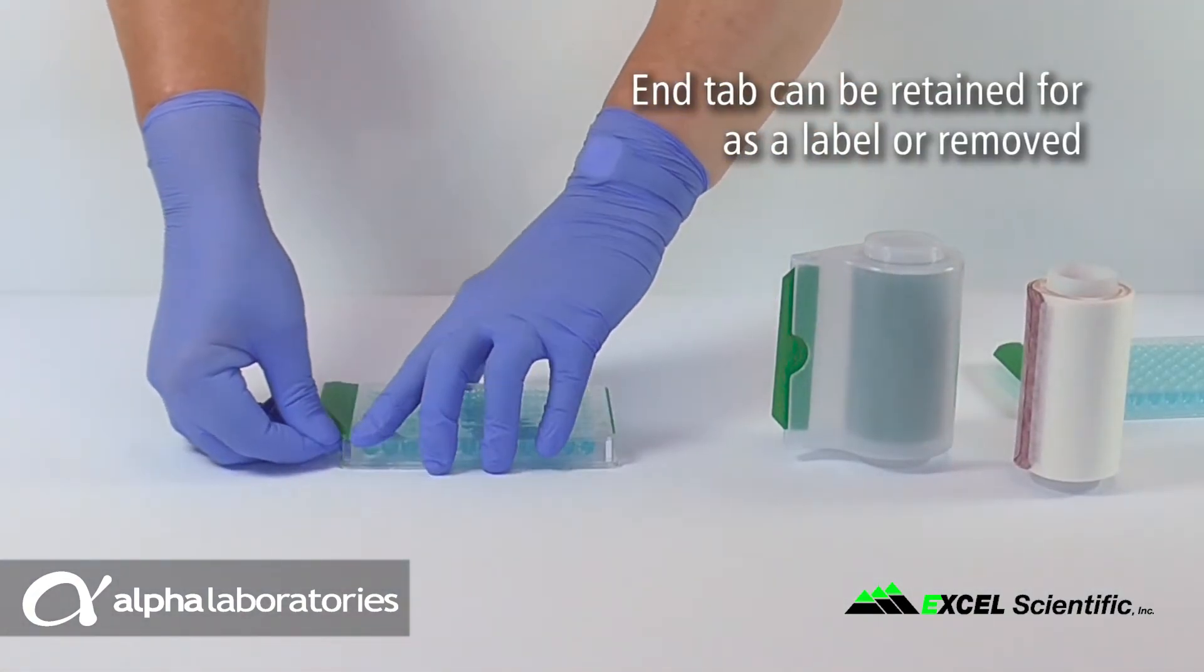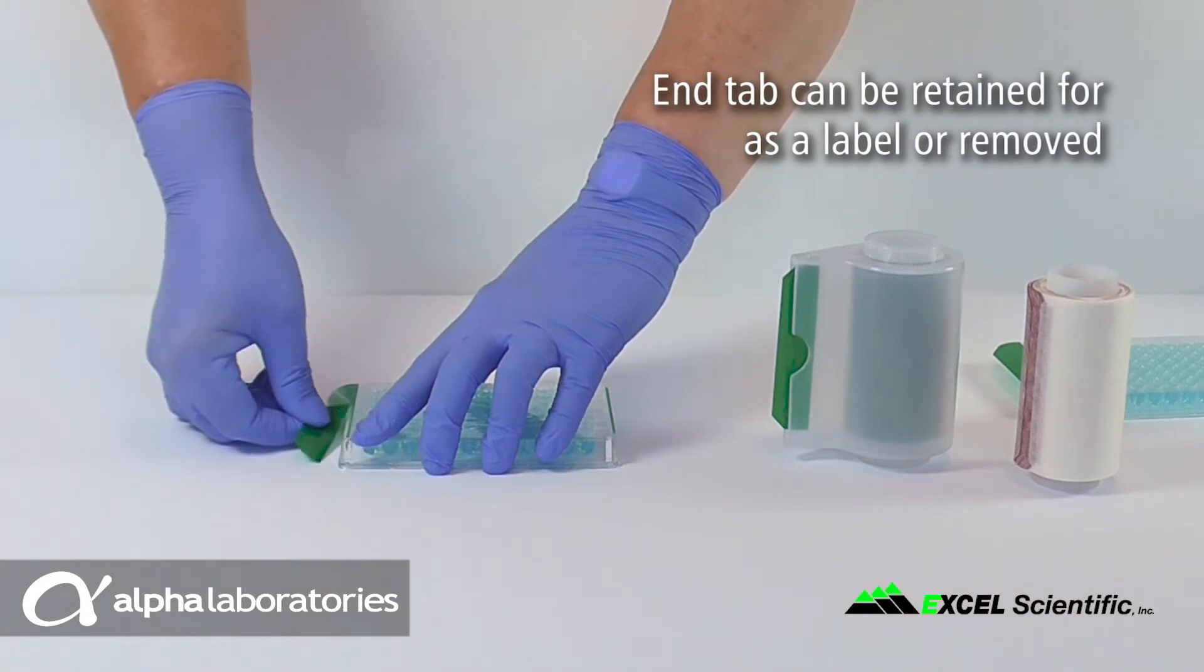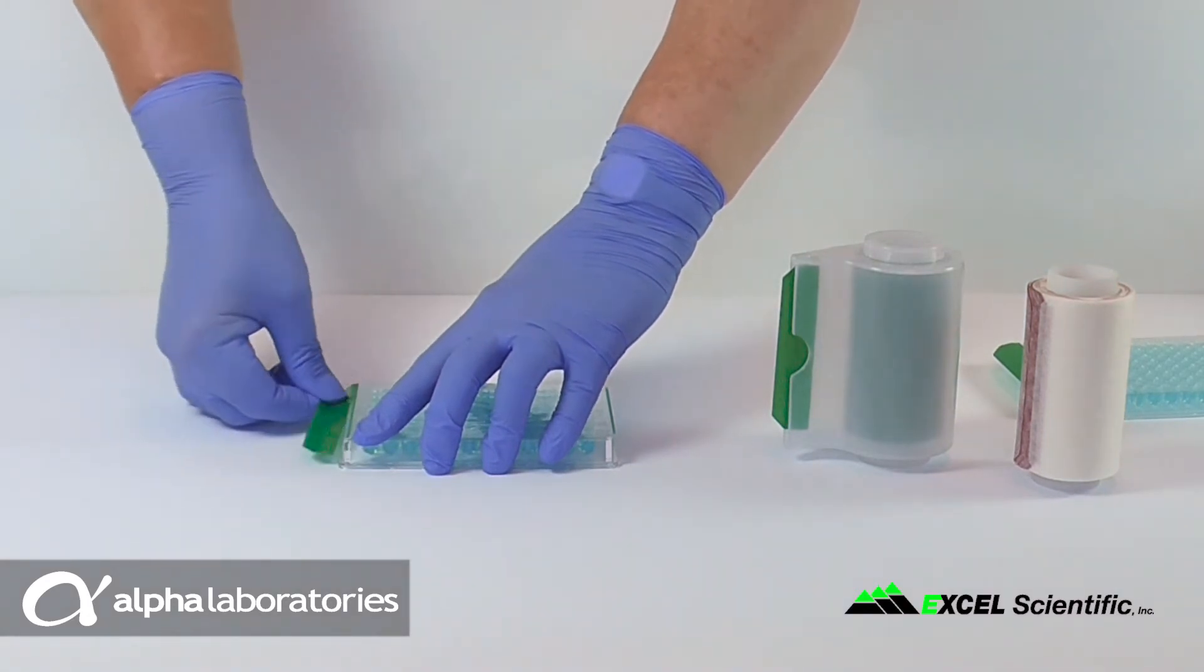The end film tab can be left in place for labeling purposes or removed at the second perforation as preferred.